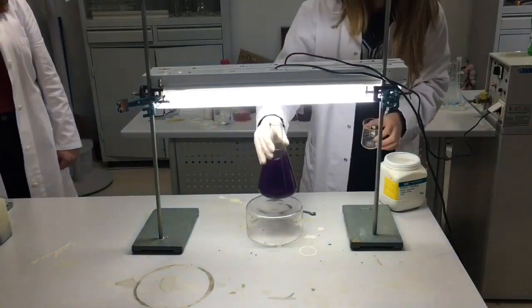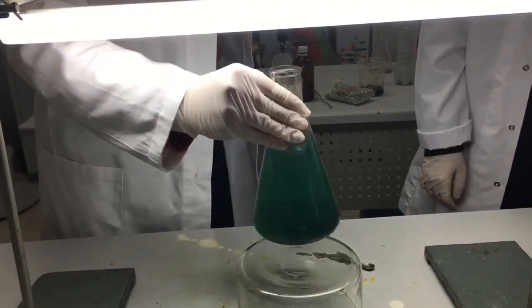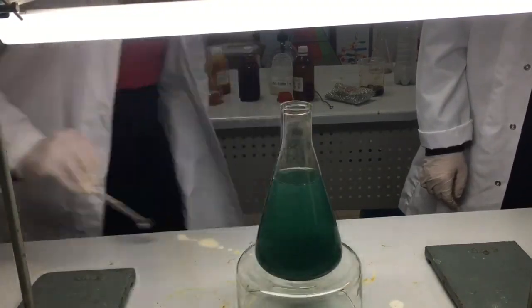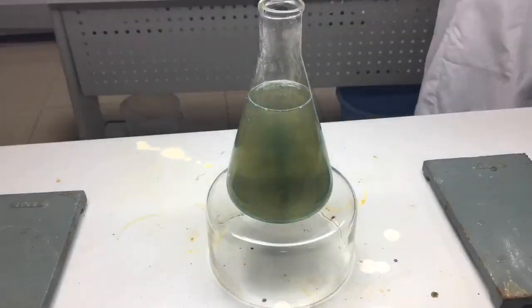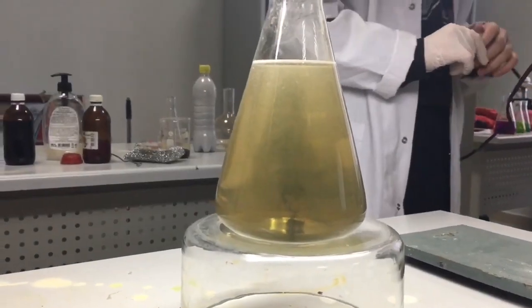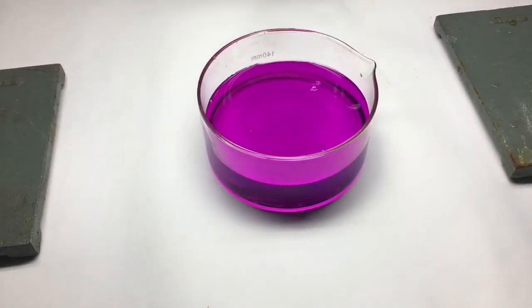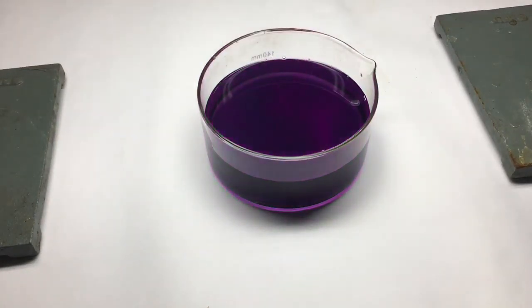Now we mix the 2 solutions together. Now we can see the purple color turning into green and then into orange.